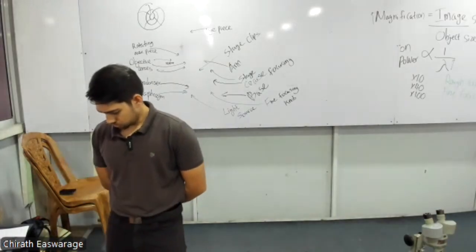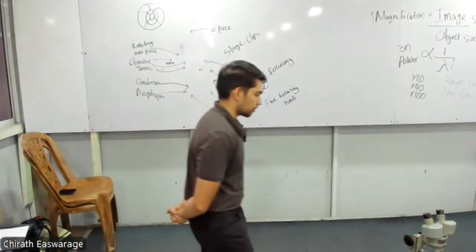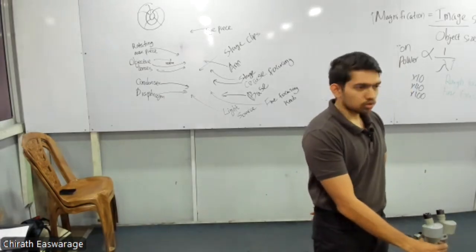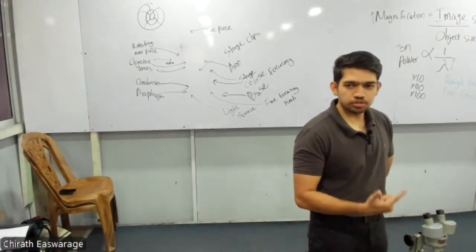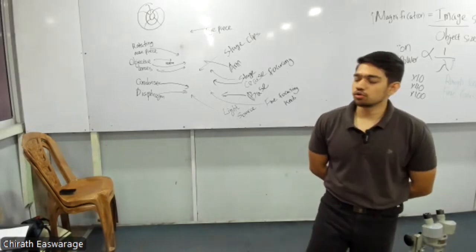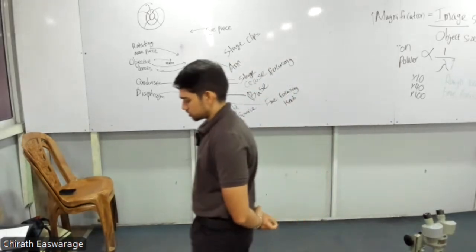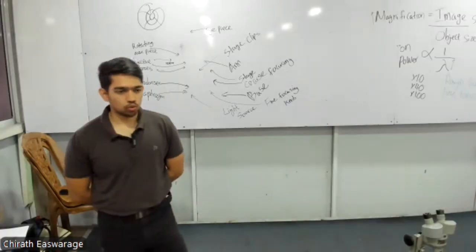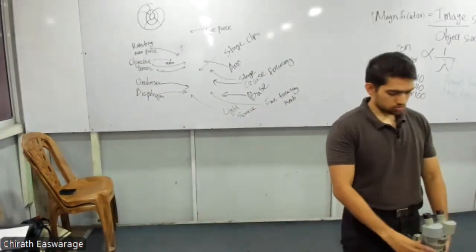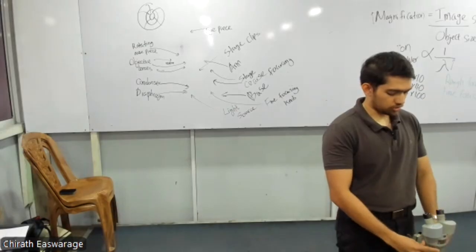Then rotating nose piece. What is the function? To change the objective lenses to the field of study.